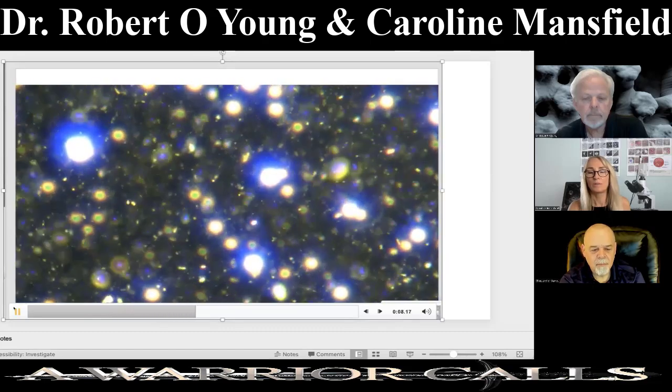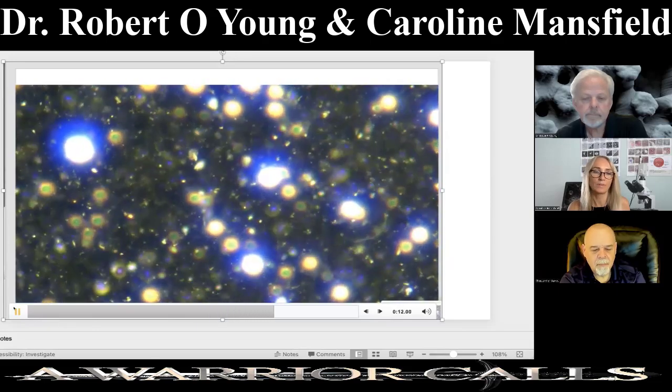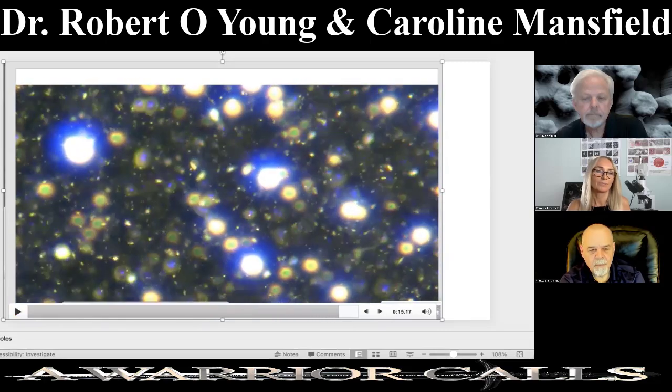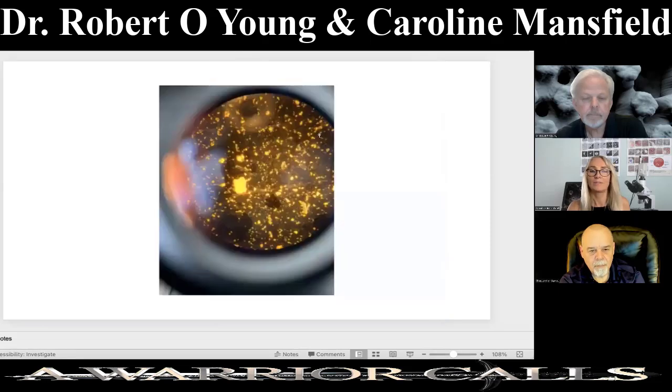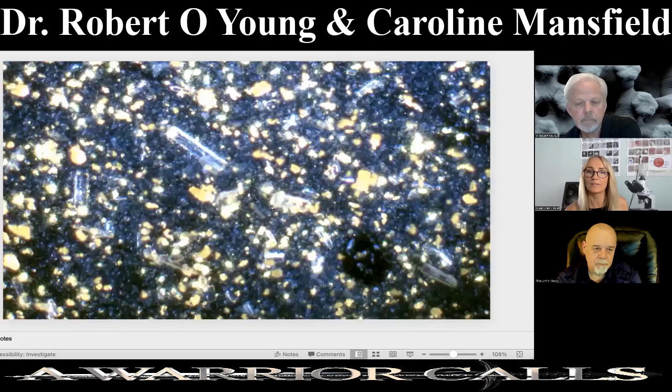This is an organic skincare product, just made of flowers and seashells. And again, this is another product under the microscope. This is a food source product. And that's what it looks like when you're looking down the eyepiece. And then when you look at it under the microscope, it looks like this.